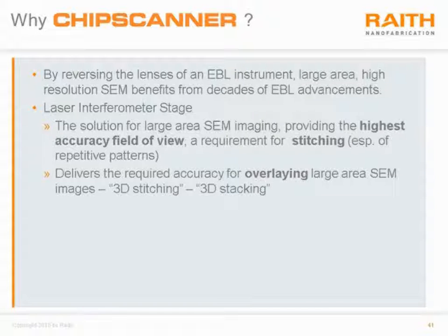Furthermore, stitching in a third dimension is possible, and this is very important because the challenge gets much greater when you enter the third dimension in stitching.